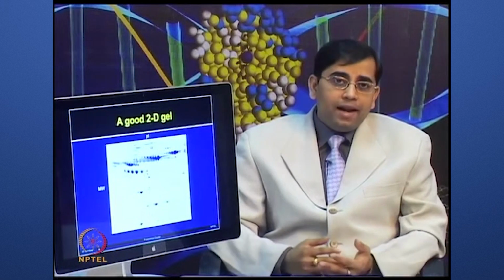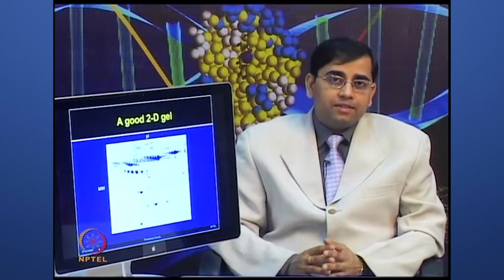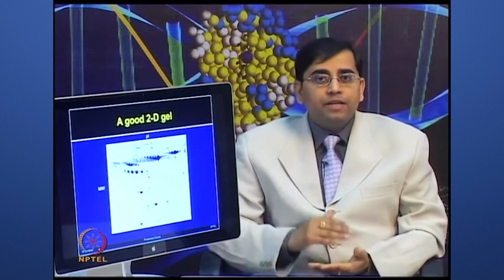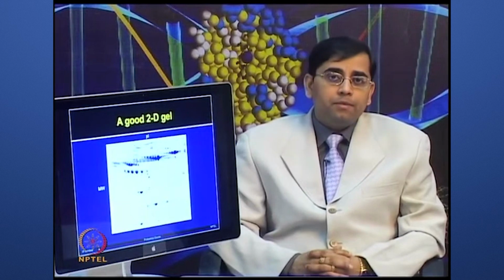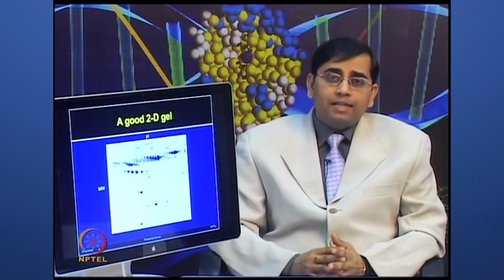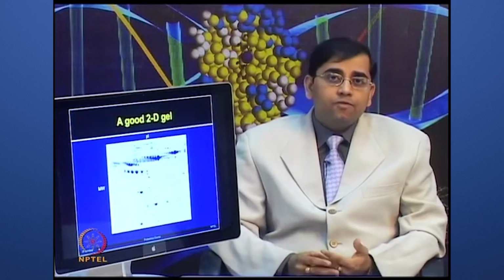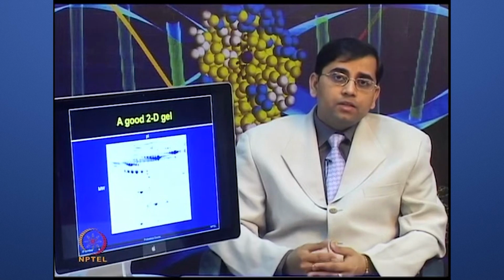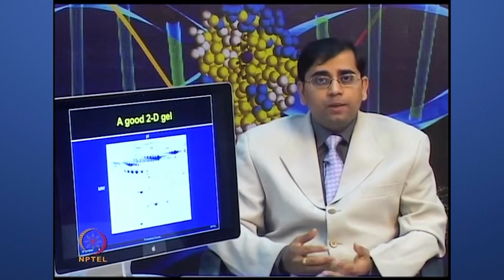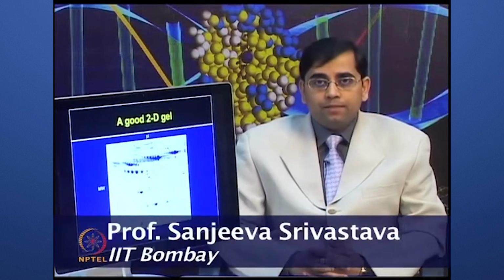On one hand, it is a good idea to keep all your parameters very consistent, so that the gel migration and all the protein resolution will have the same parameters. At the same time, even if all your gels have not run exactly the same length, the software can still help you with image processing. You need to do various types of image processing before you analyze your gels.